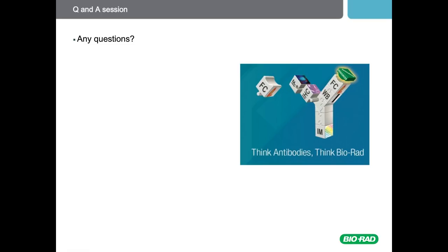Smaller dyes, such as the Alexa dyes, would probably be optimal. However, you may have to optimize this staining yourself, and it will depend on what antibodies are available. If there are no antibodies available with the fluorophores you wish, you will have to either find the best secondary or use PE and APC.